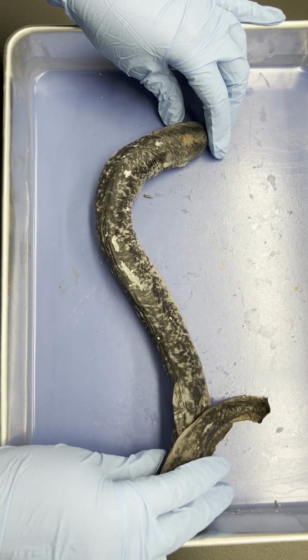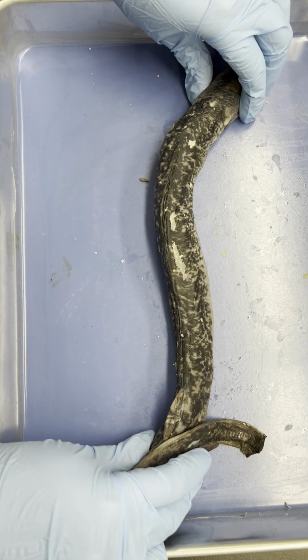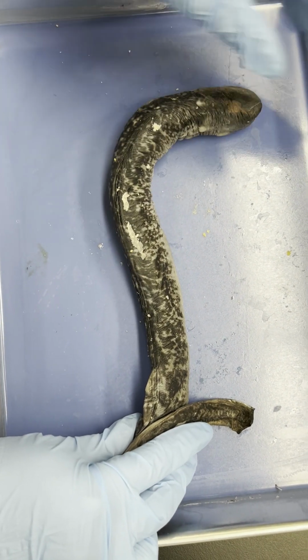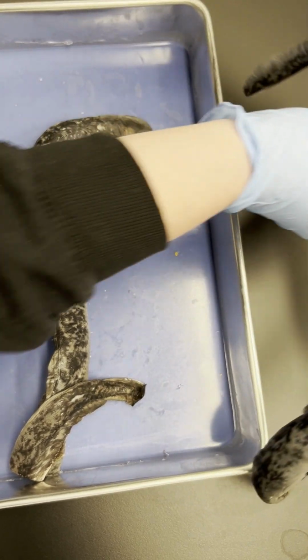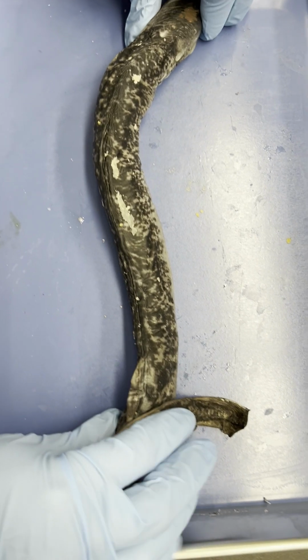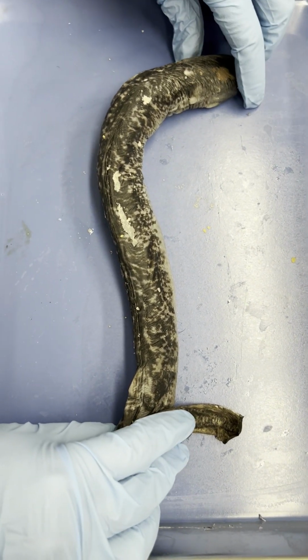Hi guys, this is Dr. Mick again. So now we're going to be doing some cross-section cuts. Now, you will need a second specimen for this because your first specimen was where we made those sagittal cuts, the sliced hoagie cut. These cross-section cuts are going to be more similar to if we were chopping a cucumber, except we're going to be more precise and do fewer sections.